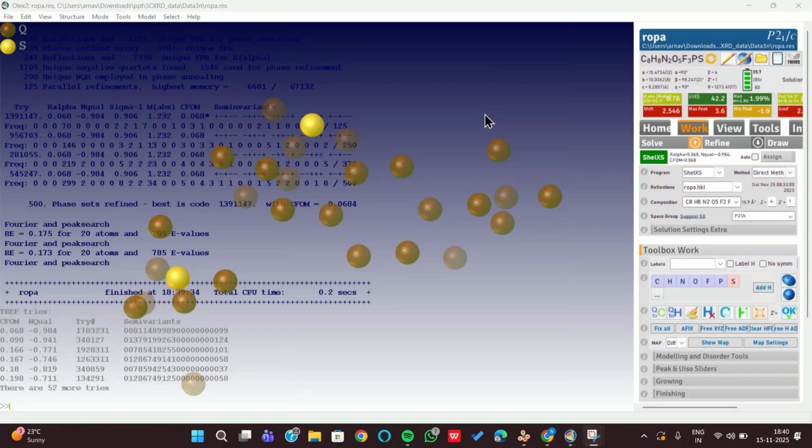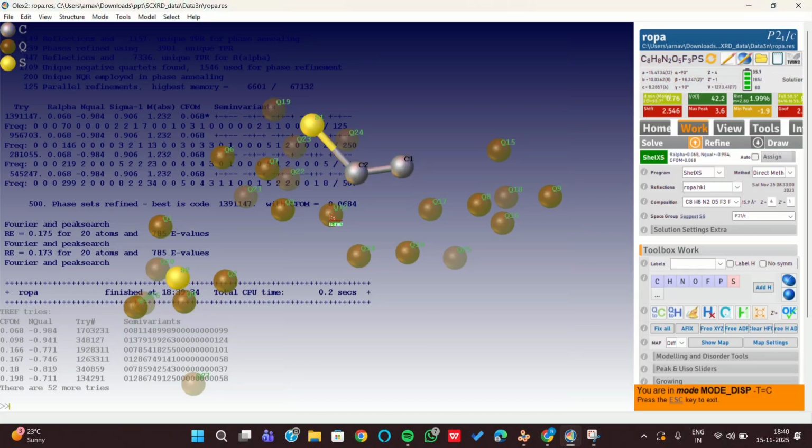The structure, which has this chemical formula, is basically Riluzole with phosphoric acid. We have already solved this, and you can see the electron density. There is one benzene ring over here, so we'll just simply assign this as carbon. Now the benzene ring was attached to a 5-member ring which has sulfur, nitrogen, along with 1 carbon. Now there would be 2 nitrogen.